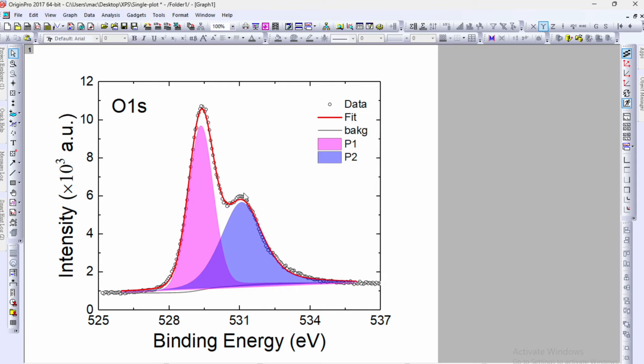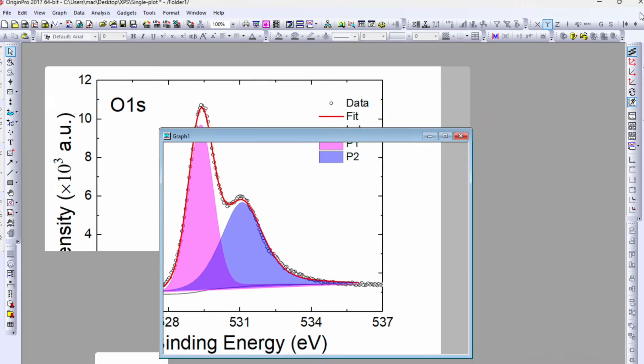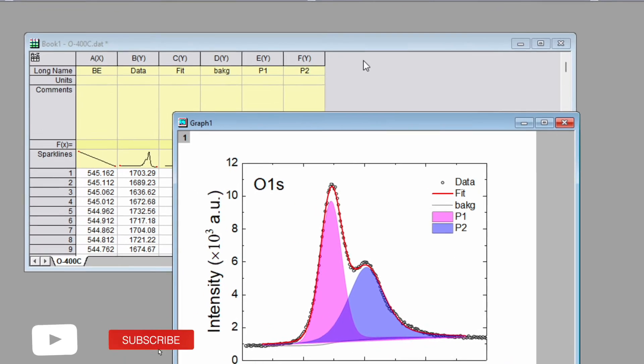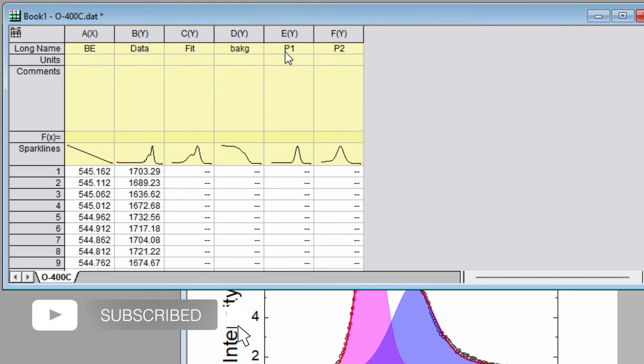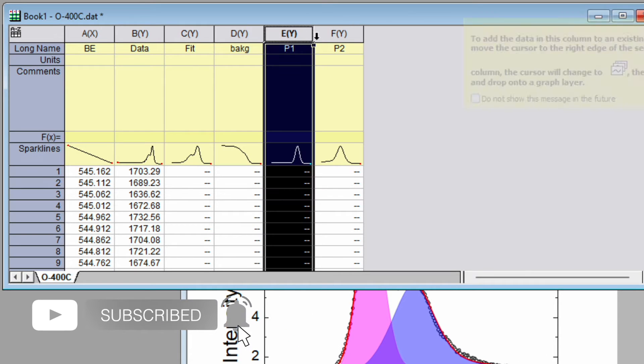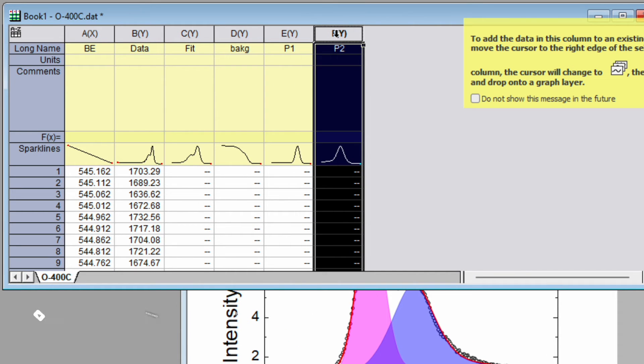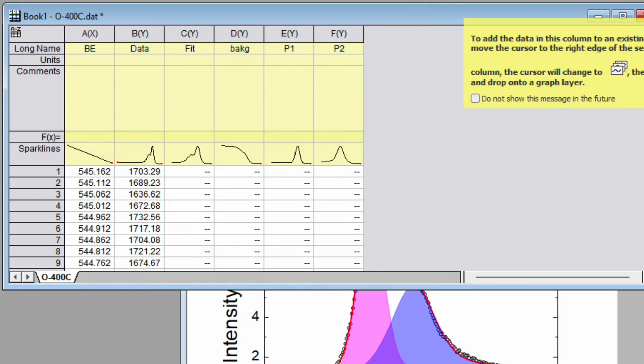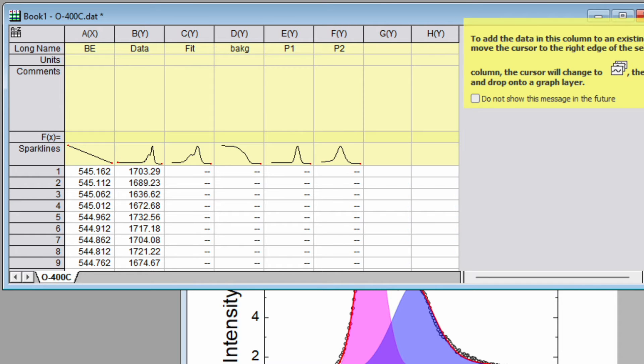So how to do that? Let's go back to the raw data. This is peak p1 and peak p2. After deconvolution, create two new columns.